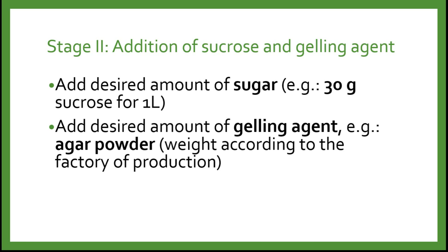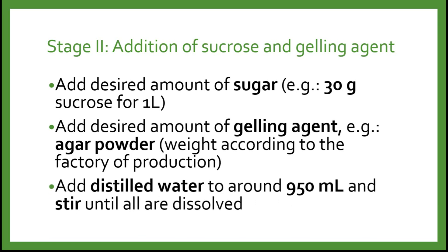Next, we add the desired amount of gelling agent such as agar powder, following the manufacturer's instructions on the bottle. For home use, you can also use agar powder from the grocery. After that, we top up the volume with distilled water to around 950 ml and stir until all are dissolved, if preparing 1 liter of media. I always leave a 50 ml buffer — so for 1 liter I top up to 950 ml, and for 500 ml I top up to 450 ml — because we still need to do pH measurement and adjustment.